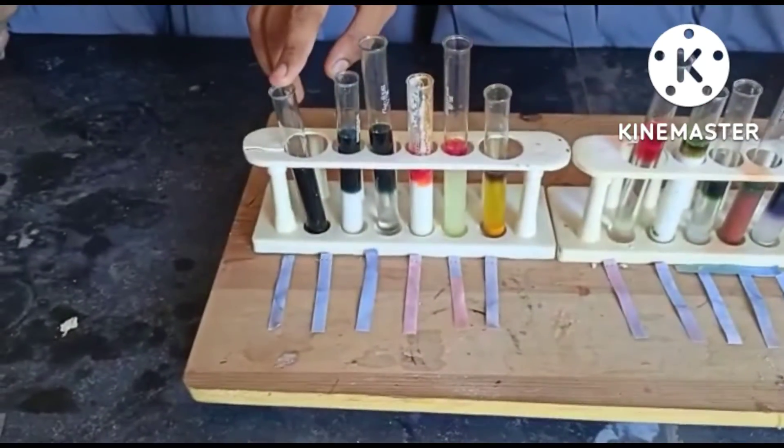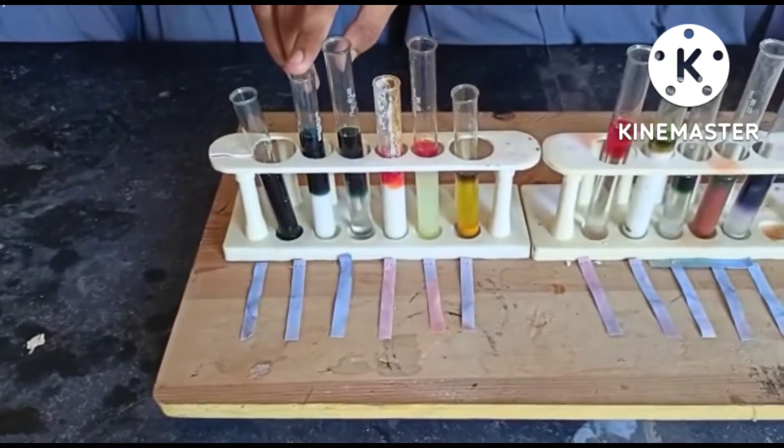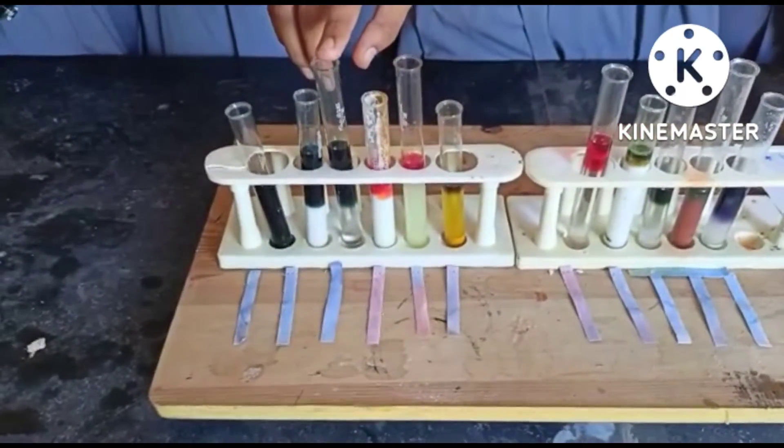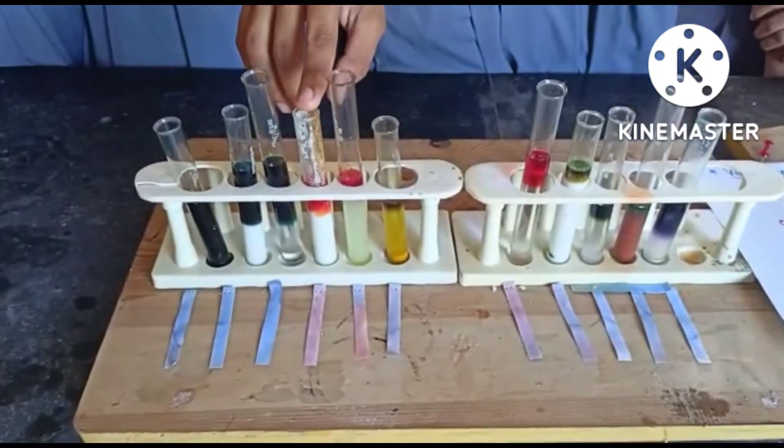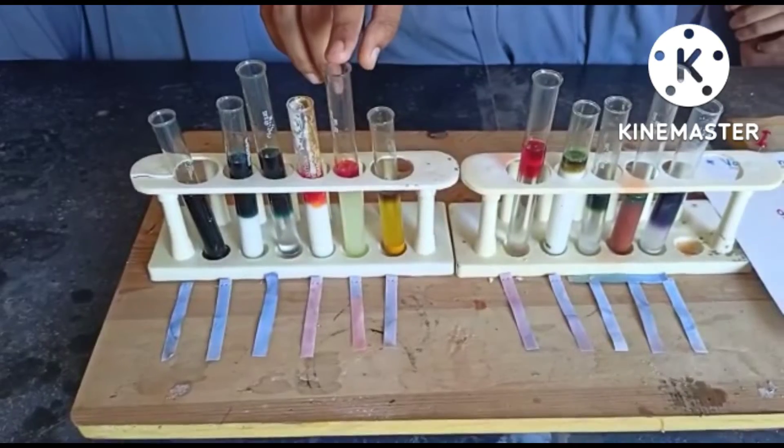The pH of tap water is 6.5 to 8.5. The pH of baking soda is 8.3. The pH of distilled water is 5.4 to 5.7. The pH of curd is 4.5 to 5.5. The pH of lemon juice is 2 to 3.